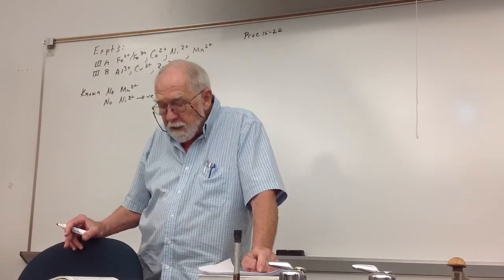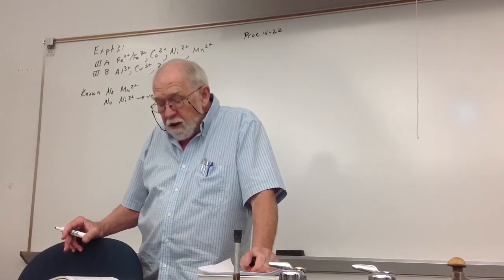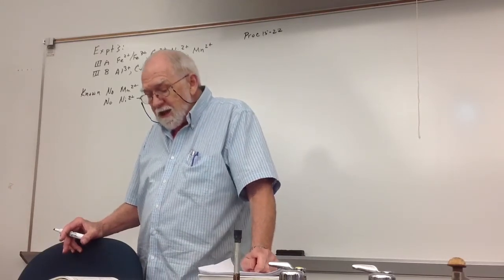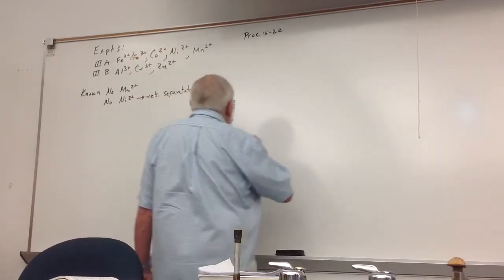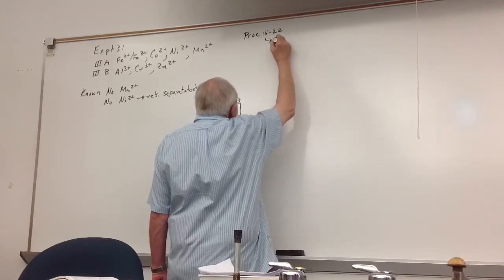Okay. So basically, you're going to calculate your drops as before, put them all in the casserole, boil it down a little bit, and then put everything into the test tube. He says 3 drops, you want to use everything. And I give you 6 drops, you want to use the 6 drops that I give you.